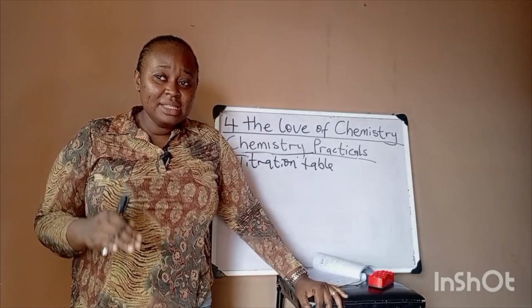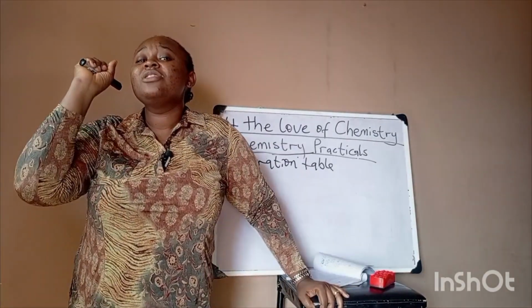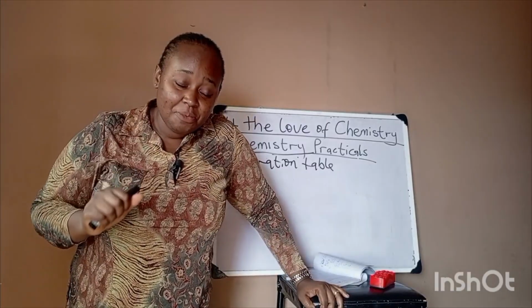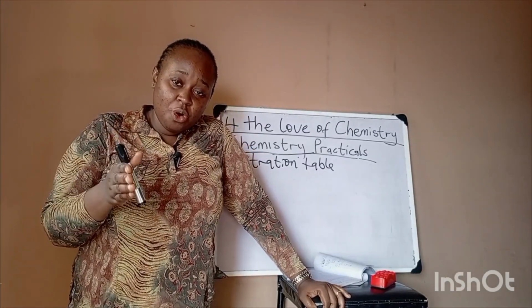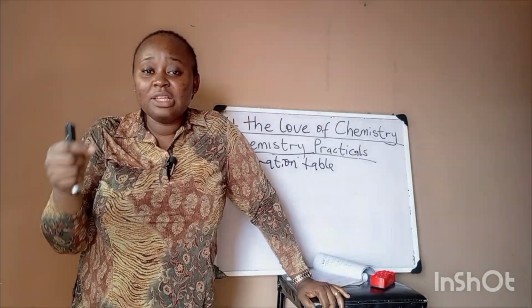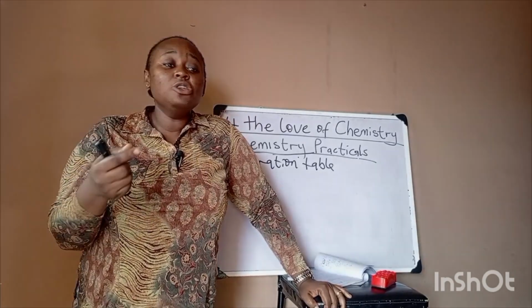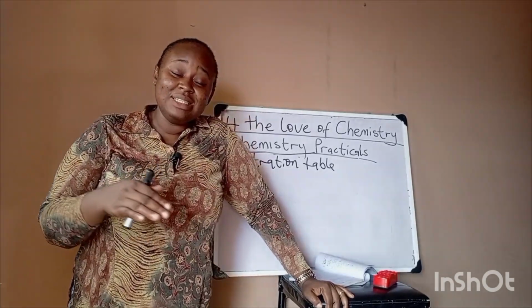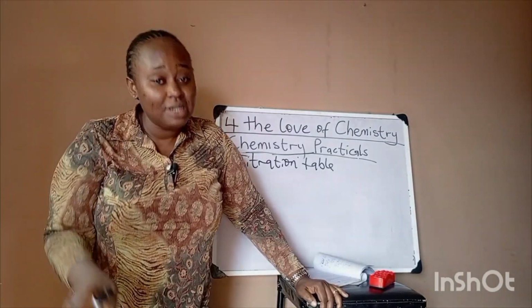So that means that no matter how good you are, you need to have a knowledge of what your teacher's endpoint is, so that no matter all the mistakes that come with, let's say, the different reagents and other things, what you are calculating or writing down in your book is something that will give you the mark that you deserve.